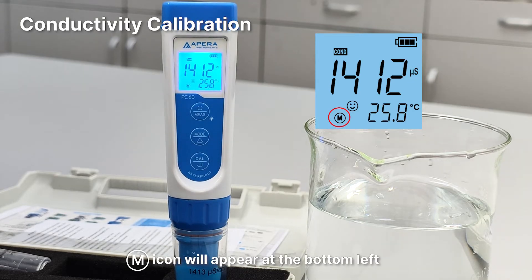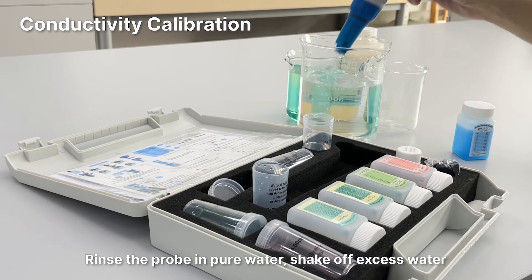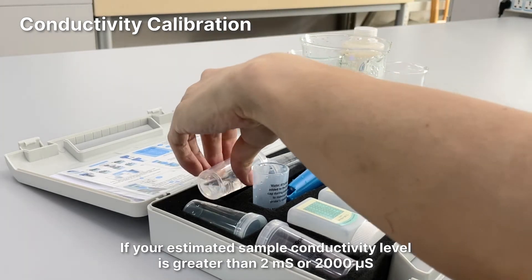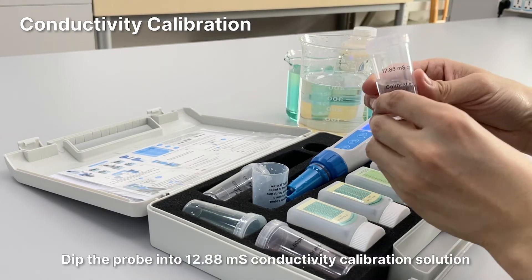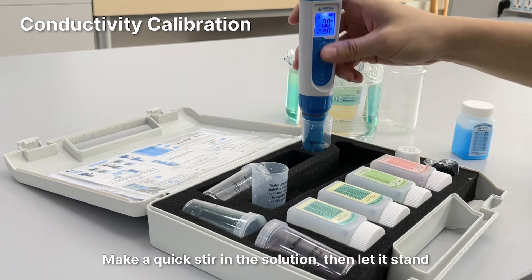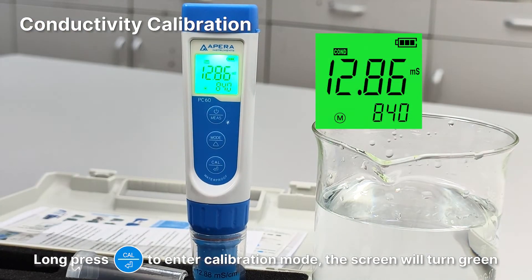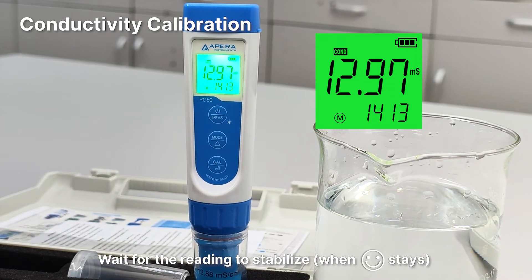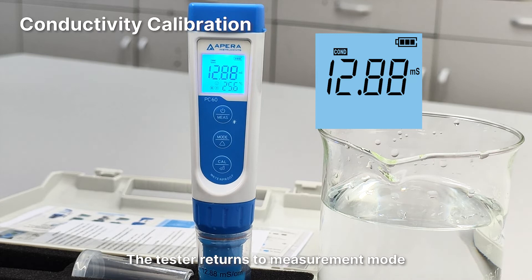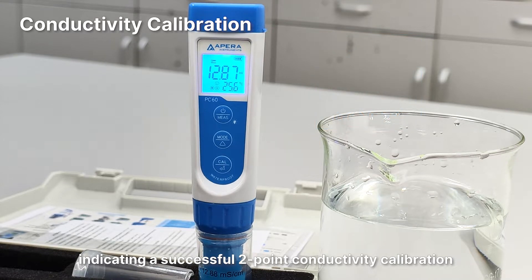The tester returns to measurement mode. The M icon will appear at the bottom left, indicating a successful first point conductivity calibration. Rinse the probe in pure water and shake off excess water. If your estimated sample conductivity is greater than 2 millisiemens or 2000 microsiemens, dip the probe into the 12.88 millisiemens conductivity calibration solution. Make a quick stir, let it stand, and long press the cal button to enter calibration mode. When the smiley face stays on, short press the cal button to finish the second point calibration. The H icon will appear next to M, indicating a successful two-point conductivity calibration.